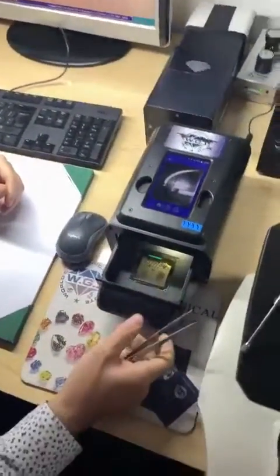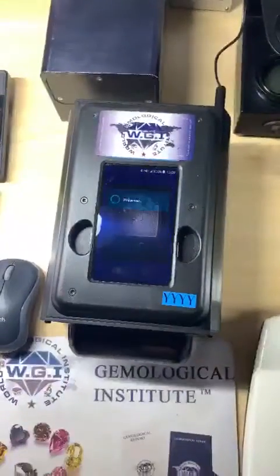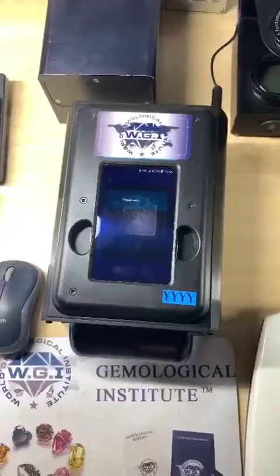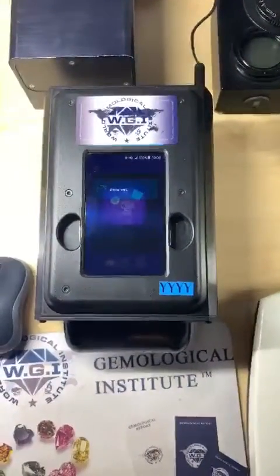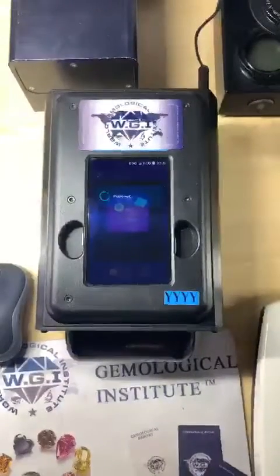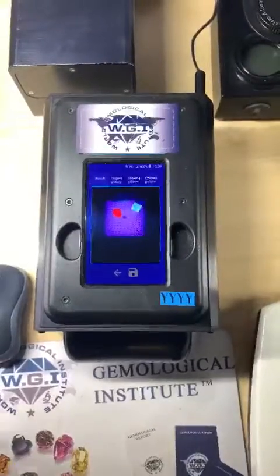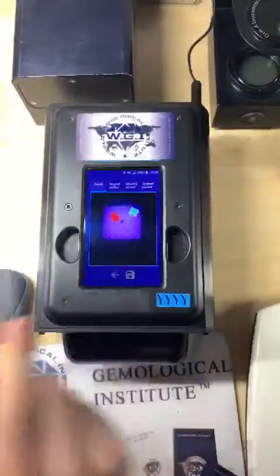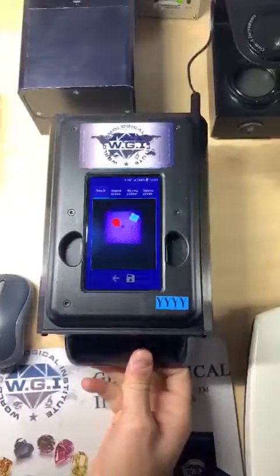With both of them in the machine, we close it and run the test. Here are the results: the princess diamond is natural, and the round brilliant is lab-grown — synthetic.